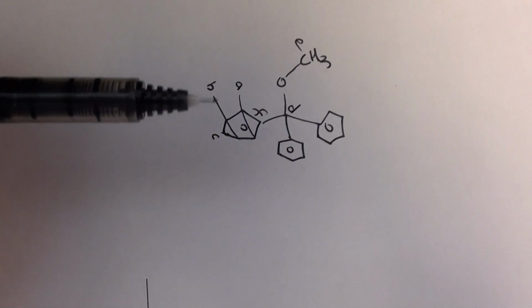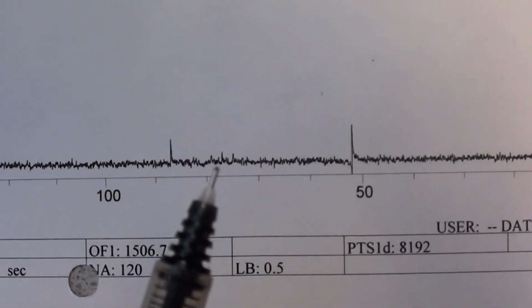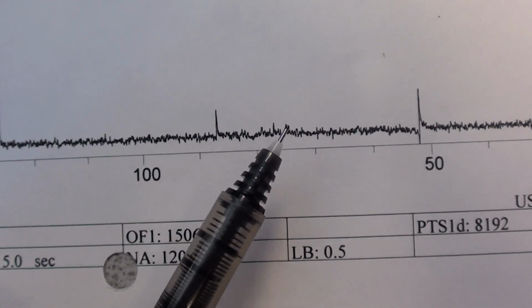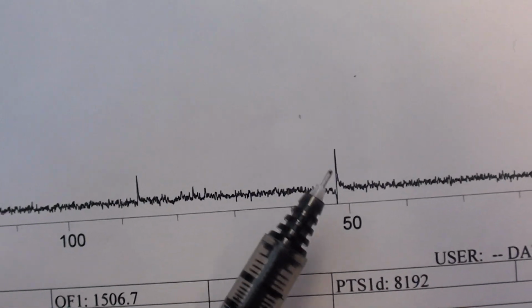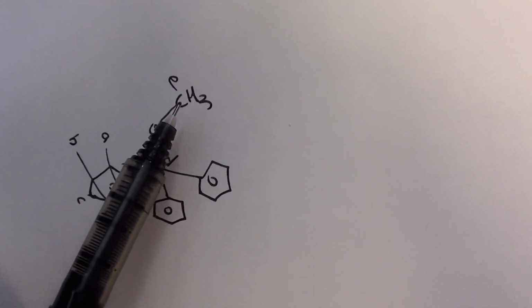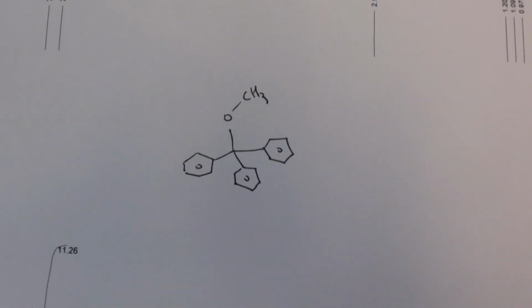C was the second highest, and A and B are the other two tall ones. D, we're going to find that very similarly. You can just start to make out the three peaks of your chloroform. This one has to be carbon D, and the classic one near 50 is the carbon of a methoxy group. That would be E. So that one came out very nice for Ken and Zuber.